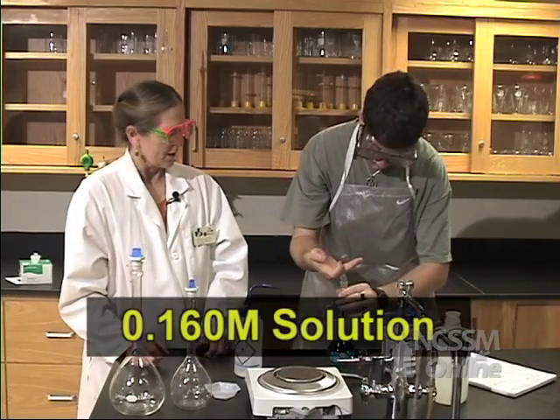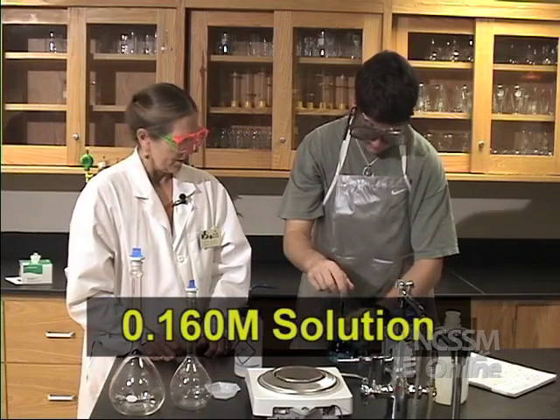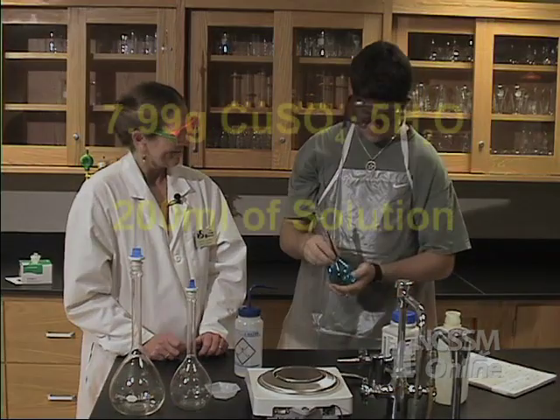There we go, that should do it. So now you have a 0.16 molar solution. That's all there is to it.